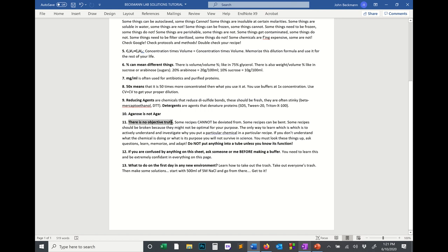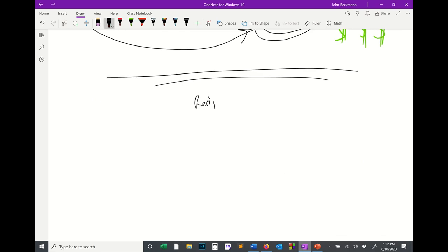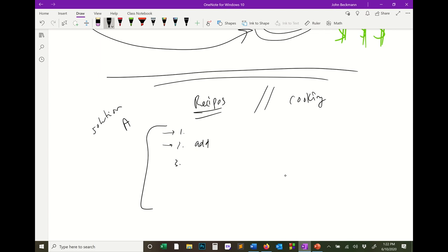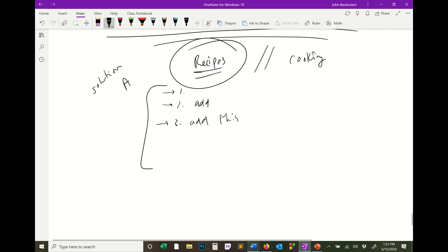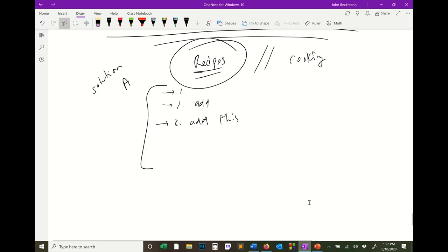Okay, so let's go to this point 11. Another point about how there isn't objective truth. When you are in the lab, you're going to encounter lots of recipes. Essentially what we do in the wet lab is a lot of cooking. If you need to make solution A, it's going to have a little recipe and it's going to say, add this. Then step two, add this. Then step three, add this. One point I want to make is that with respect to these recipes and protocols that you will encounter in the lab, some recipes cannot be deviated from. Some recipes need to be followed perfectly. Sometimes, though, you need to change the recipe. Let me give you a particular example. It might be the case that you're doing an experiment and your experiment didn't work.